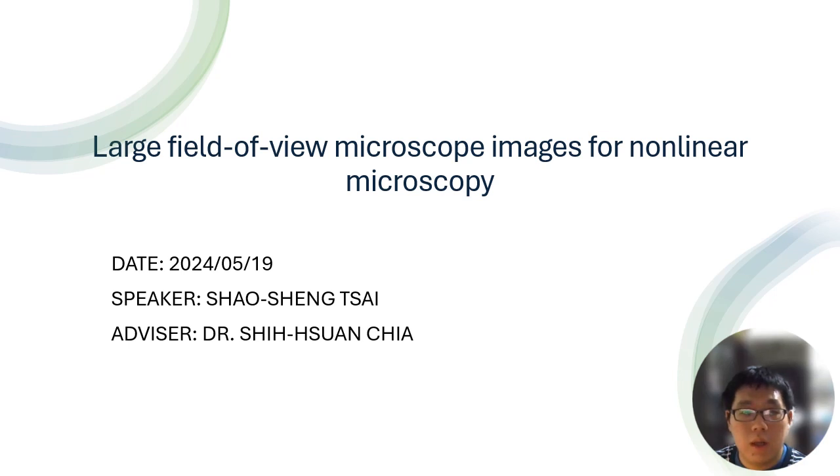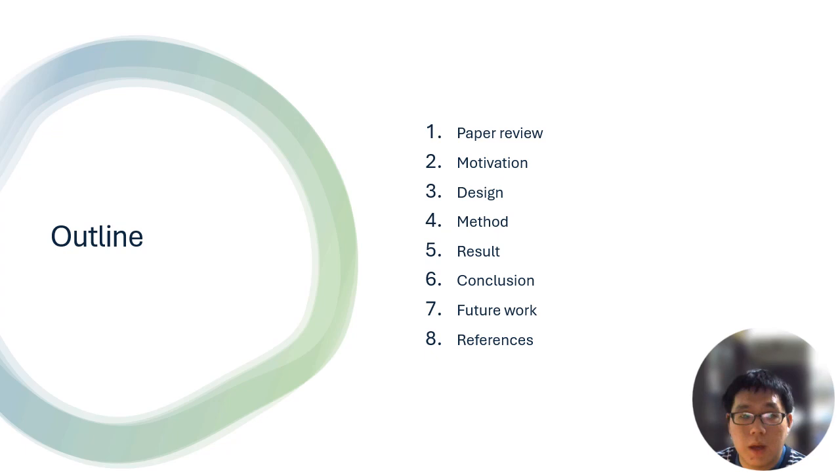Hello everyone, I'm Cai Shaoxiang, and today I'm going to introduce a large field of view microscope for nonlinear microscopy. Here is my outline: paper review and motivation, design, method, results, conclusion, and finally the future work and reference.